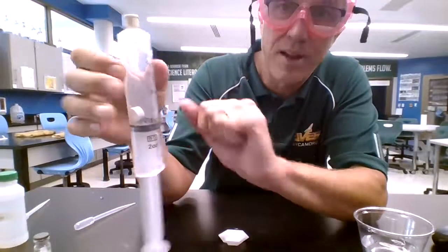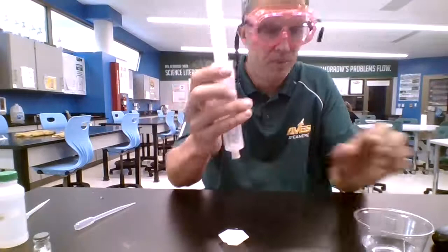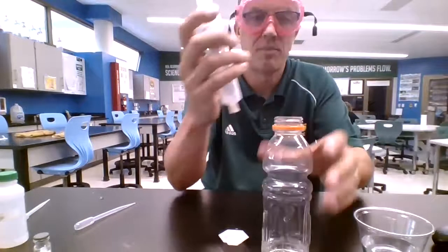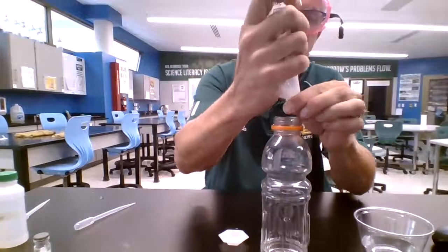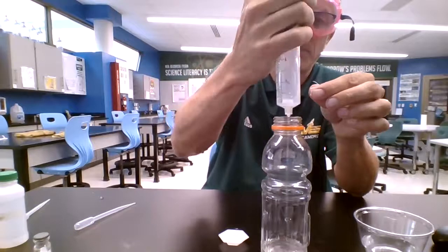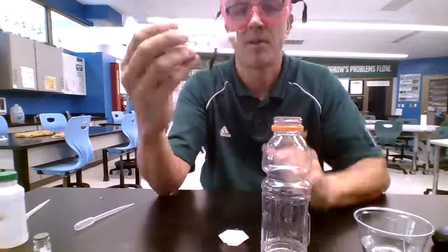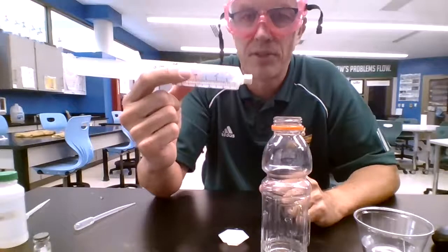Now, there's some fluid in there, and I'd like to get the fluid out. So watch how I do that. I'm just going to do this, put it over my little bottle here, take this off, and I don't even have to push it out hardly, just a little bit. And there you go. And there's the gas.